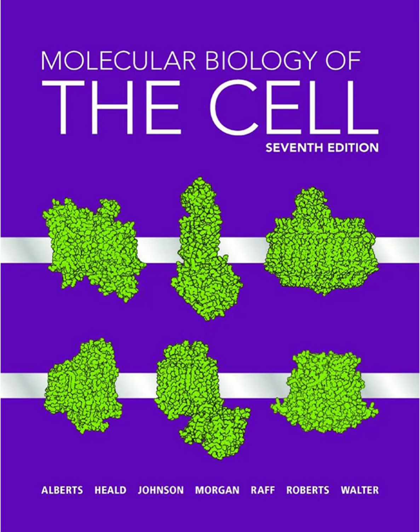Exactly. And longer wavelength infrared light penetrates much deeper into tissue with less scattering. Plus, the excitation only happens right at the focal point where the photon density is incredibly high, so there's very little out-of-focus excitation or photo damage. So deeper imaging, less background, less damage. You got it. It allows imaging up to 0.5 millimeter, sometimes even more, deep into living tissues. Huge for neuroscience, developmental biology.